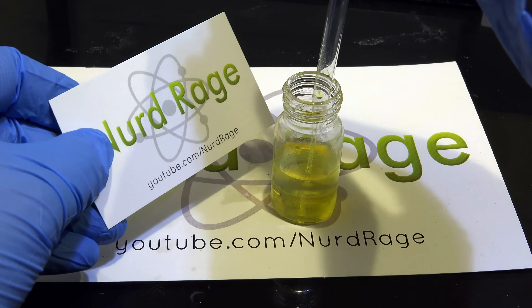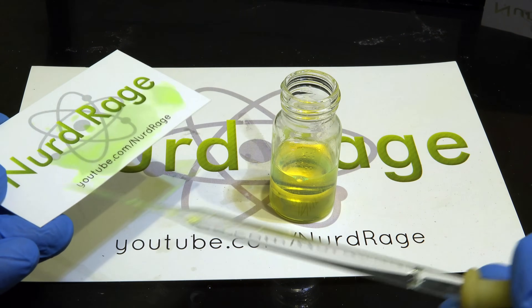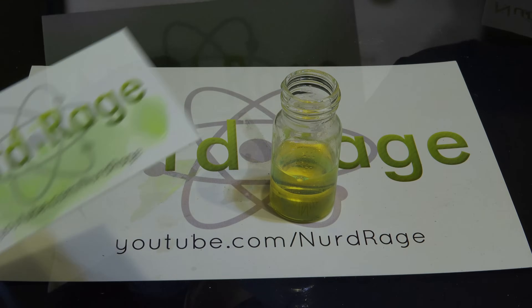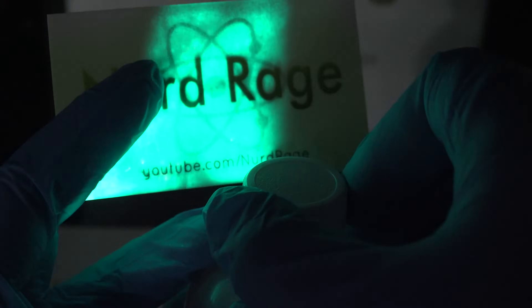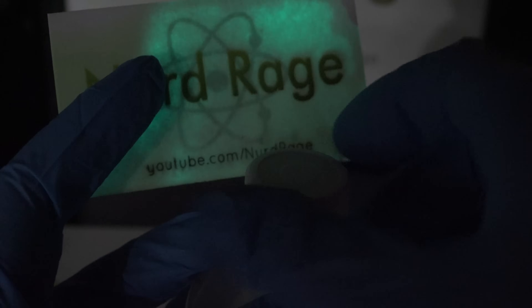I've repeated the same experiment but this time I'm using 9,10-bis(phenylethynyl)anthracene for a green color. Let me set it up — opening the cap, and there we go. That is awesome.